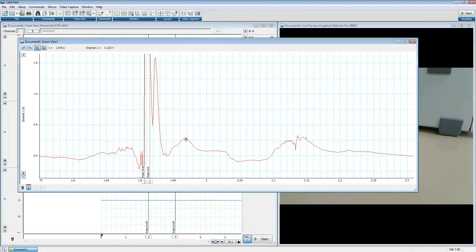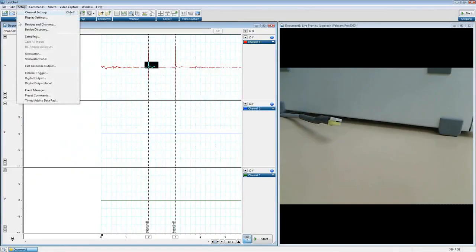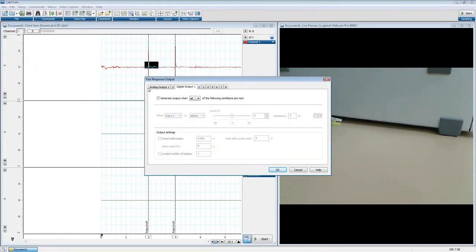If you have questions about that, definitely put them into the questions box in the GoToMeeting control panel, or you can email me if you have more questions. I can show you a little better what exactly it means. But it's a percentage of total range. That's a big thing to remember as well. If you're recording at a range you probably shouldn't be, you'll see really strange small hysteresis values, and you wonder why. That's why, because it's a percentage of total range.